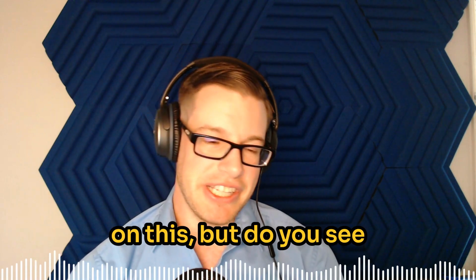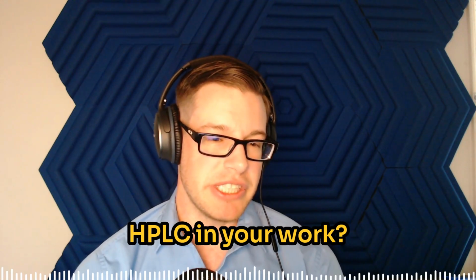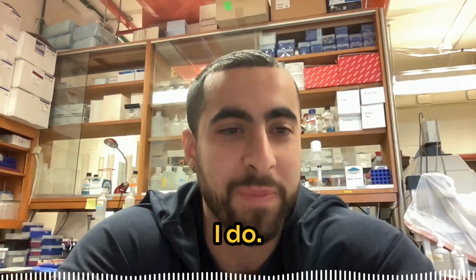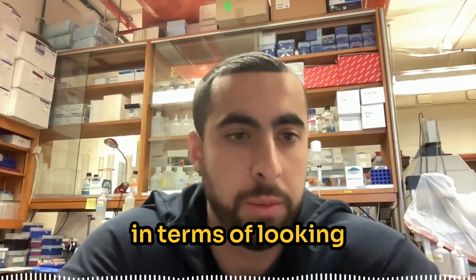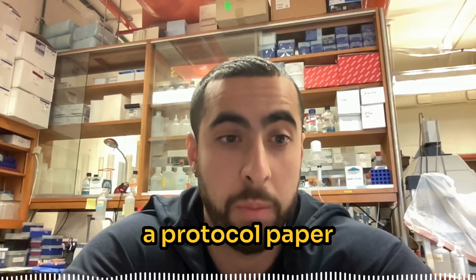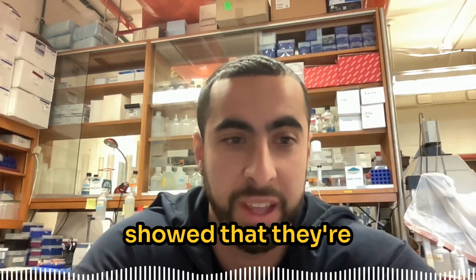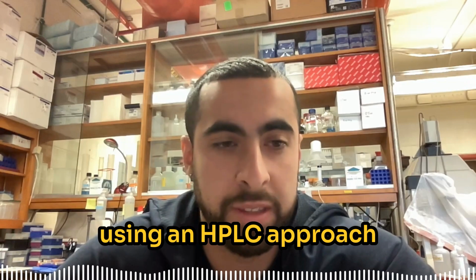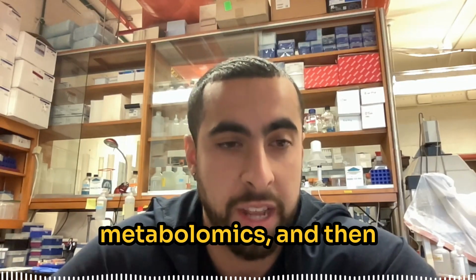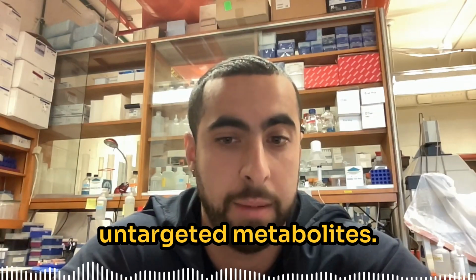I know you touched on this, but do you see trying to integrate more HPLC in your work? I do. I think that would be in terms of looking at untargeted metabolomics. There was a beautiful paper, a protocol paper that just came out of Stanford at Dr. Sonnenberg's lab that showed that they're using an HPLC approach to do untargeted metabolomics, and then they compare that to a reference database of untargeted metabolites.